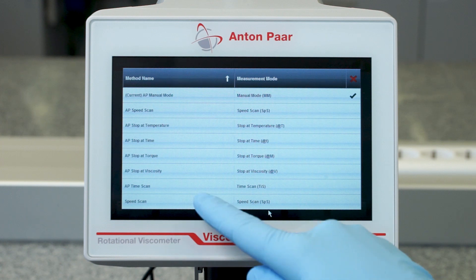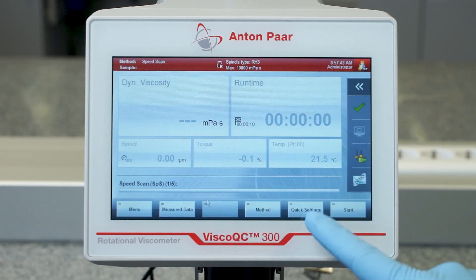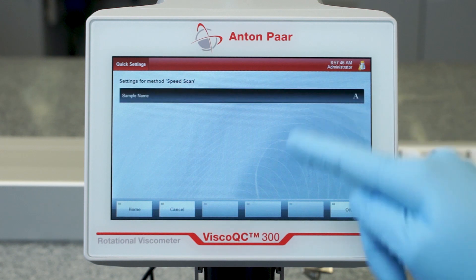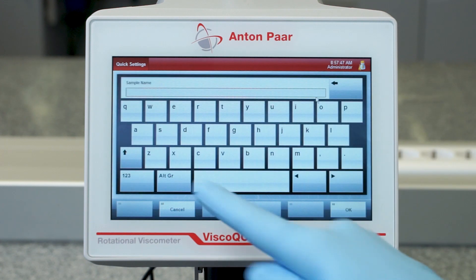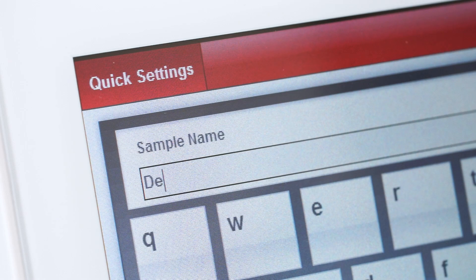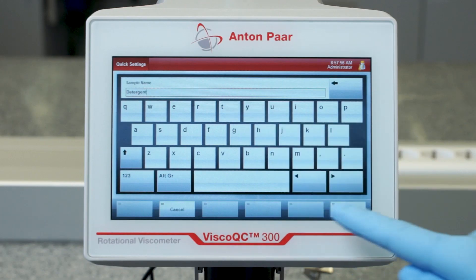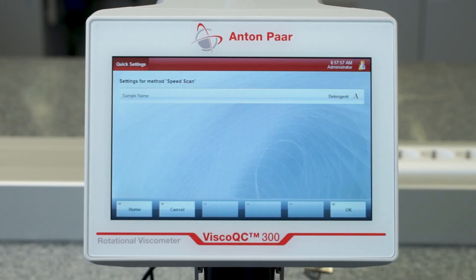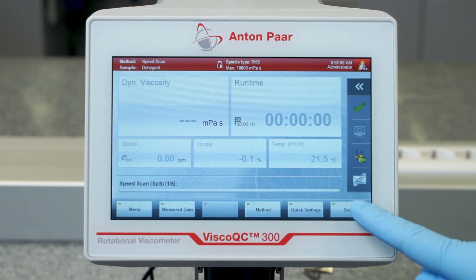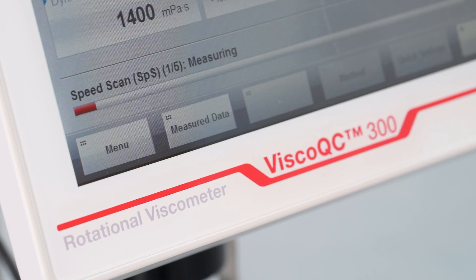Go back to the main screen and choose your method. Insert a sample name. Tap start to begin your multi-point measurement speed scan.